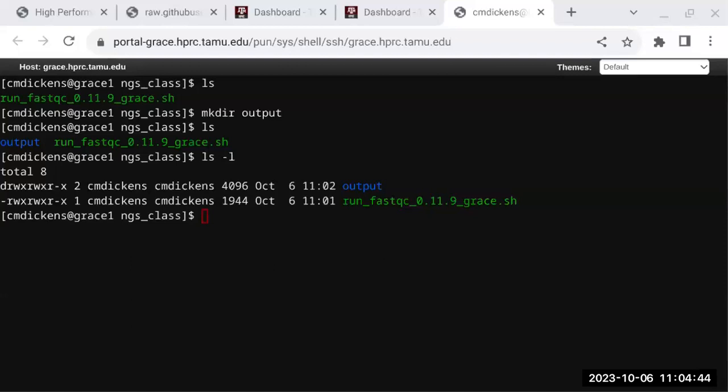Okay, and we also have some useful information here, a README file. You'll want to do this. You want to document your job script, what you did, because 3 months later, your PI is going to say, okay, what did you do? What version did you use? Why did you do this? And you're going to go back and say, oh, I forgot. Let me look at my job script. And you didn't put any comments in here. It's going to help you to put comments in there.